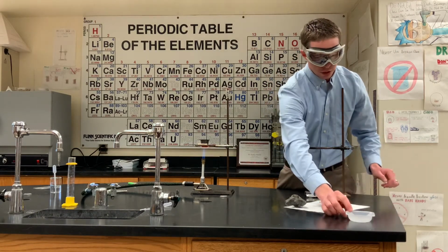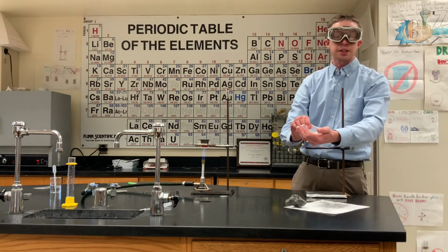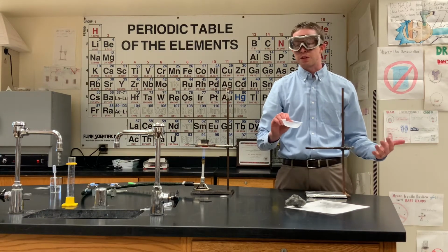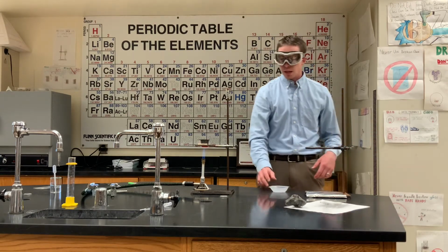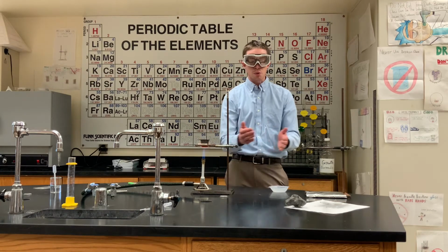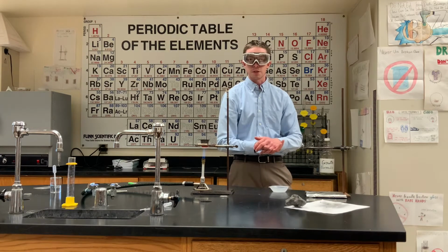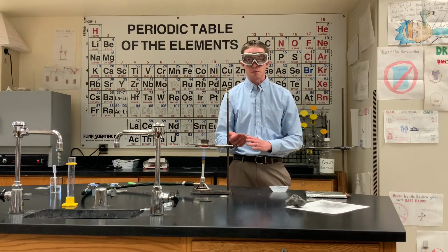And just like any good cooking show, I have a sample that I've prepared earlier, because not only do we shine it, the next step is to cut it into very tiny pieces so that when the reaction is occurring, the reaction will happen most efficiently with these smaller pieces. So right now, I'm going to let this crucible continue to heat for a few more minutes. Then I will cool it off on the base of this ring stand over here with the aluminum foil, and the aluminum foil is there to prevent any dirt that was on that ring stand from attaching itself to the crucible. And we'll pick back up in a few minutes when we're about to measure the mass.